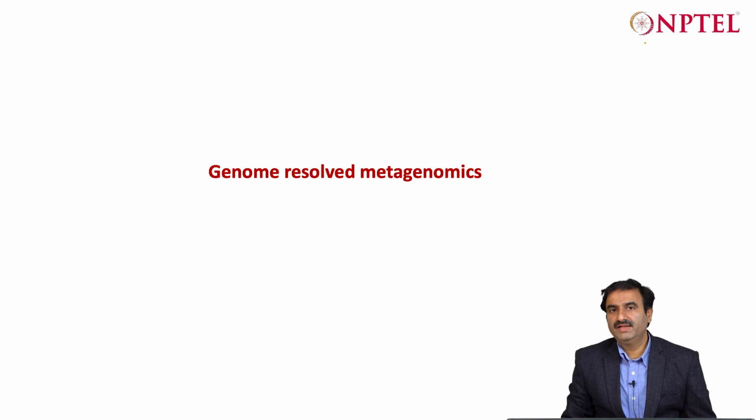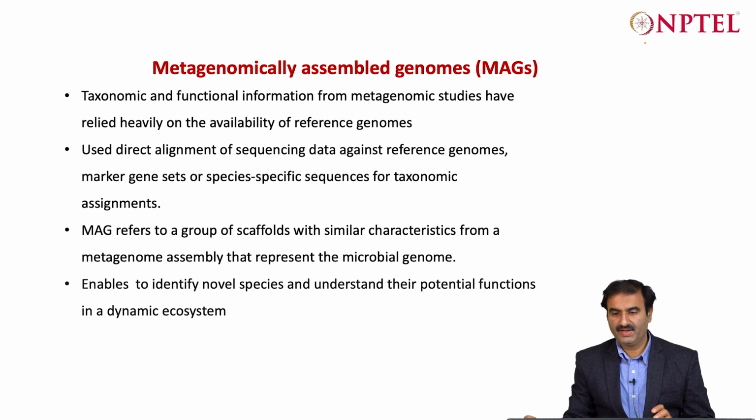Then in the next part we will deal with genome-resolved metagenomes. So basically the final aim should be to recover the complete genomes from metagenomes, but it may be limited by the amount of sequencing, because you have fragmented each and every bacterium that was there in its respective copy number, and you have lost the information of which fragment is coming from which genome. So again, reconstructing the genomes is a challenge, but at least you can try.